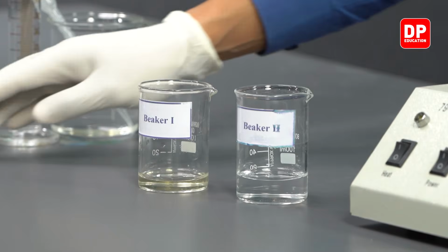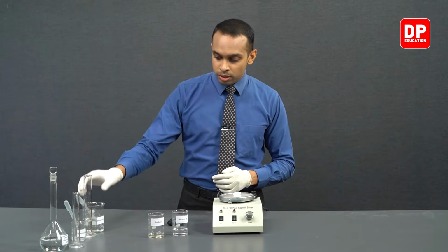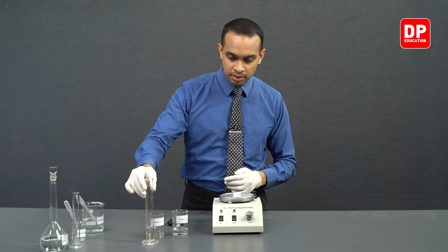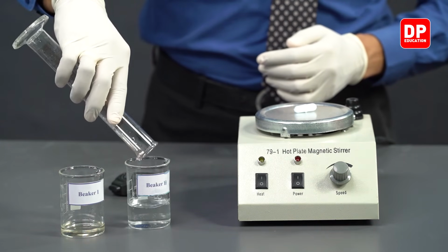And then to keep the volume constant, we have to add 15 milliliters of distilled water. So we have measured 15 milliliters of distilled water into this measuring cylinder, and we are going to be adding it into beaker 2.